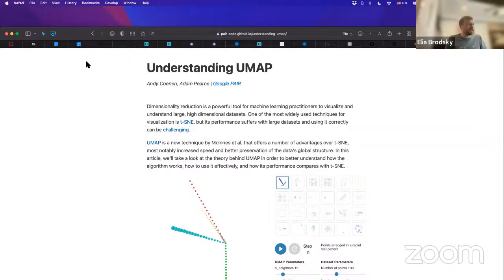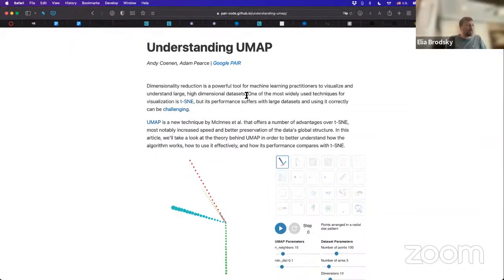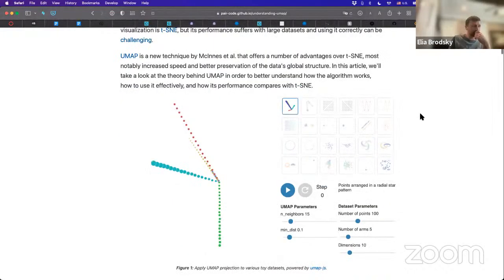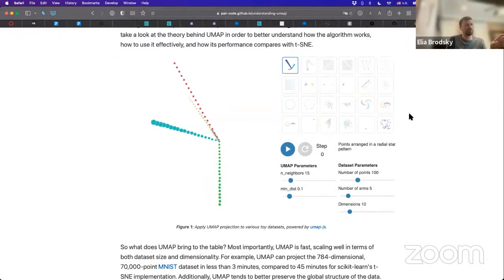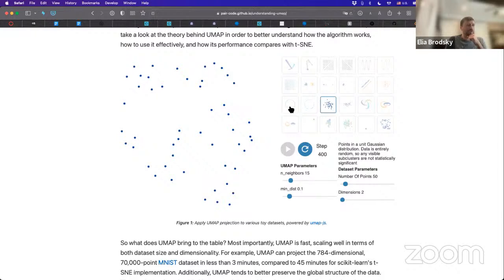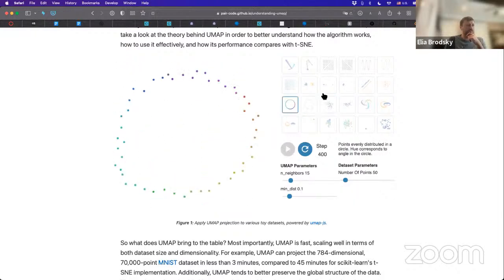Okay, so this is another example to understand UMAP. Now, UMAP is similar to t-SNE, but t-SNE runs into limitations with large and complex data sets, and we have to reduce it. And so we are kind of making a choice. UMAP does not have this kind of limitation. I'm going to make this just a little bit bigger. Here, the idea is similar. You can essentially play around with a number of parameters using these synthetic data sets, so you can see what parameters achieve what kind of result.